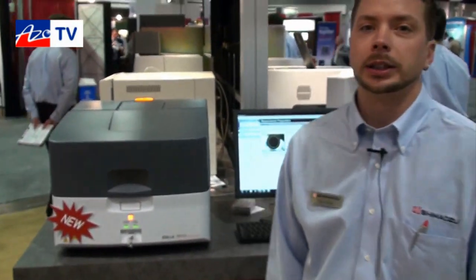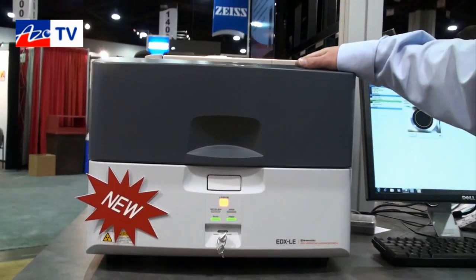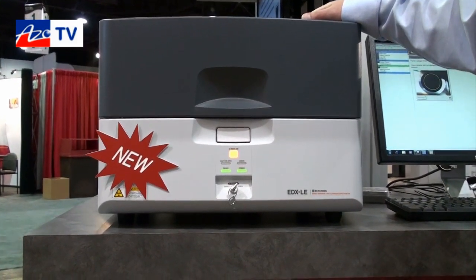This is the EDX LE — our newest member to our X-ray lineup. We offer this energy dispersive system, and we also offer wavelength dispersive and diffraction X-ray equipment.